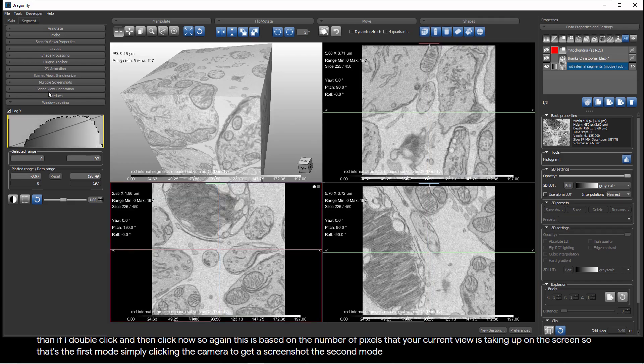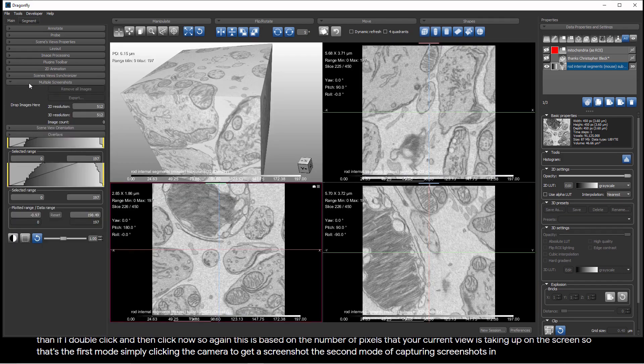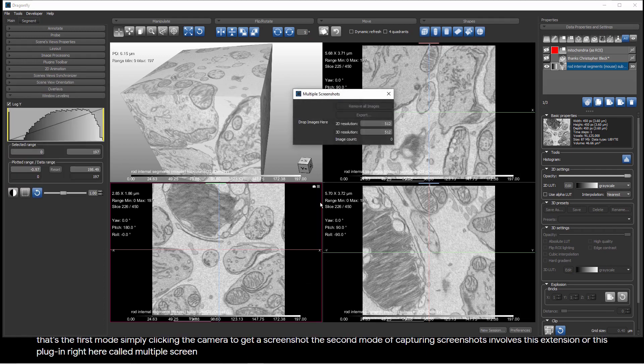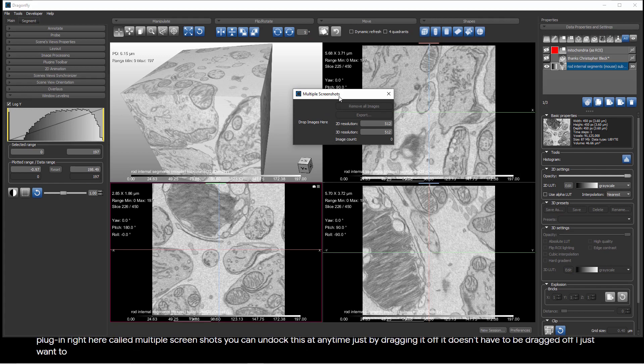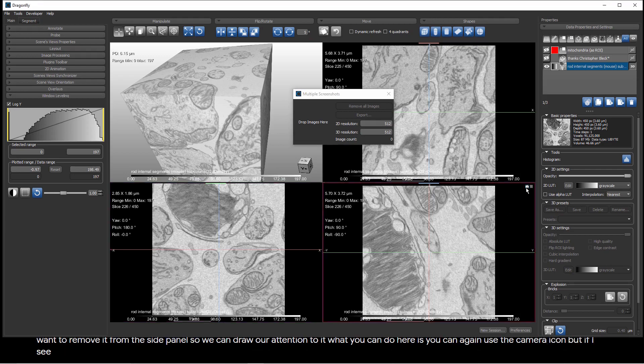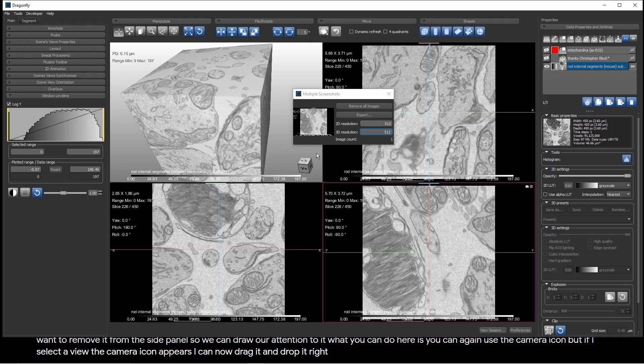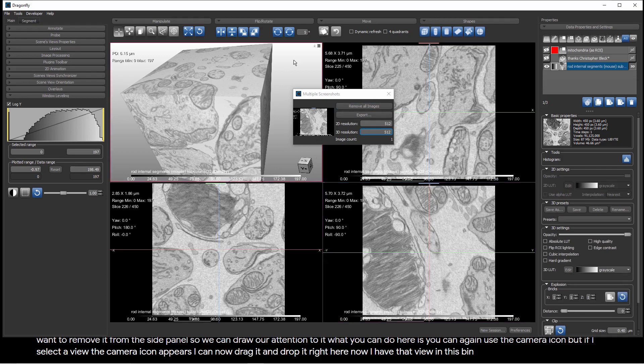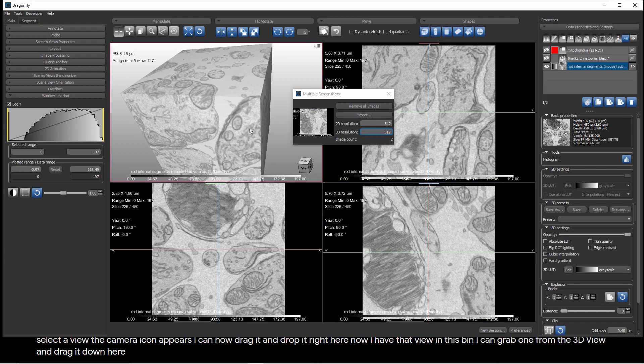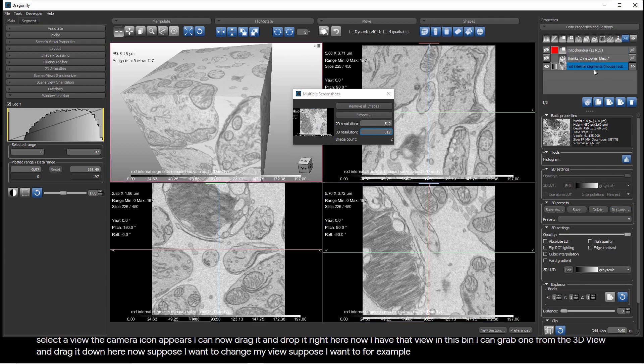The second mode of capturing screenshots involves this extension or this plug-in right here called Multiple Screenshots. You can undock this at any time just by dragging it off. What you can do here is you can again use the camera icon, but if I select a view, the camera icon appears. I can now drag it and drop it right here. Now, I have that view in this bin. I can grab one from the 3D view and drag it down here.